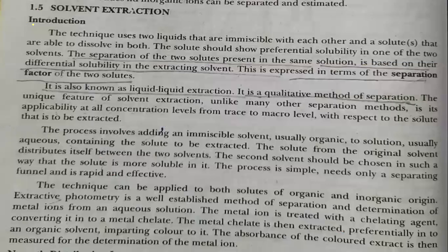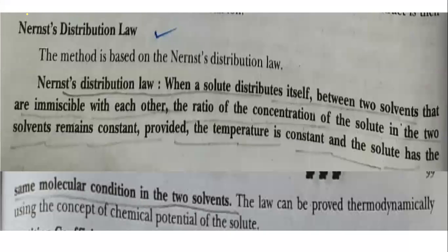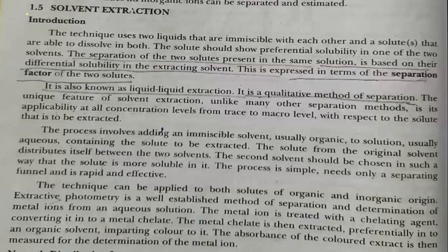After this, we are going to learn solvent extraction. In solvent extraction, if any substance is present in the aqueous phase, the technique used to take out or separate that organic substance from the aqueous phase, or from water, to the organic phase is called the solvent extraction technique.